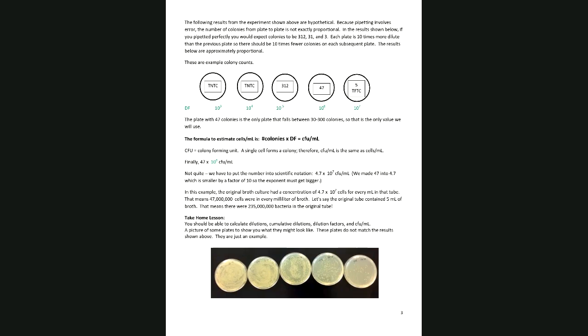In one of the videos, you'll see the pour plate technique, where they put the sample in a sterile petri dish and then they add melted agar to it. Either way works. We just prefer to do the spread plate method rather than the pour plate because it's a lot easier to do. But that's how you do a serial dilution. In your head, no calculator required, right?